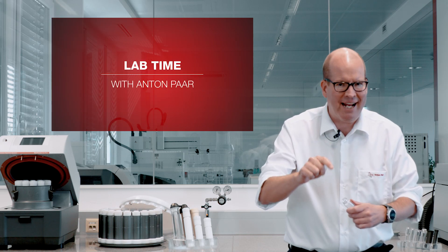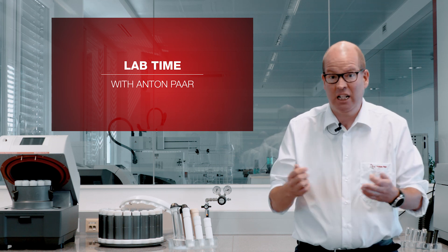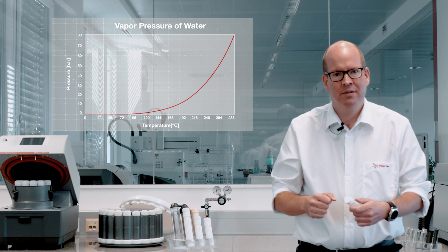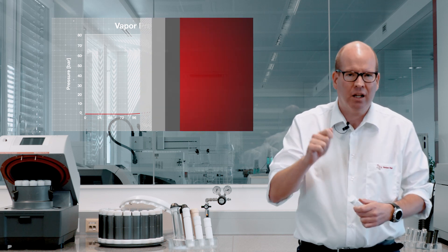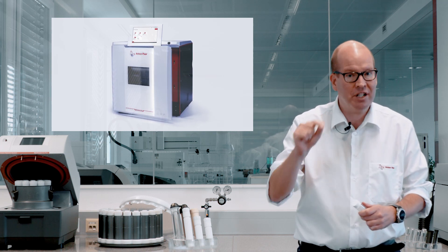Hi, I'm Tony and this is Lab Time with Anton Parr. Glass containers look innocent enough, but if you close them and heat them up, the pressure build up inside can cause them to explode. Lab microwaves are designed to make sure that doesn't happen. Kitchen microwaves aren't.